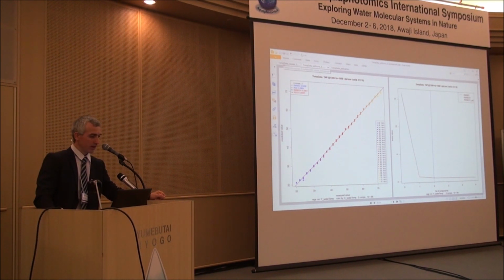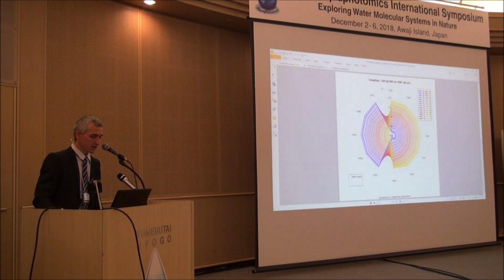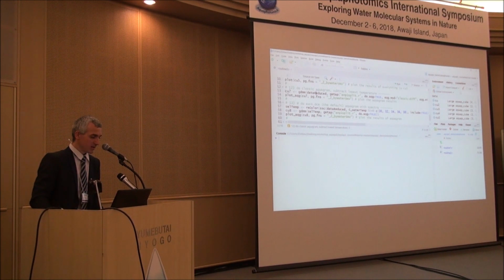And again, with this one single line, we calculated aquagrams as well, separately for distilled water, milky water, and tap water, using the classical type of the aquagram calculation method. We have, as Bernhard mentioned, several different types of aquagram calculation coded in this aquap2 package. The following lines will show you another type of aquagram calculation.